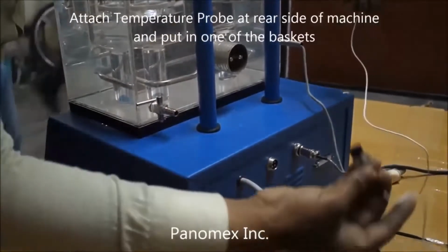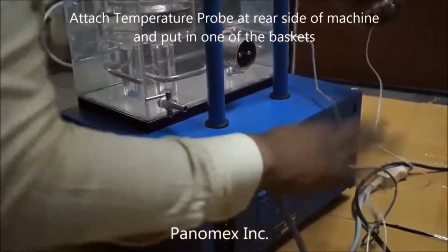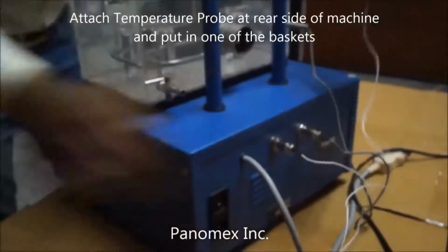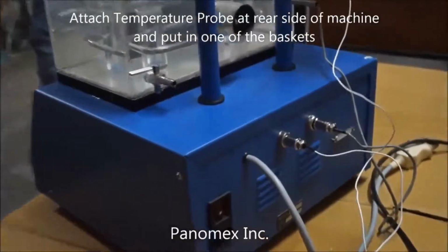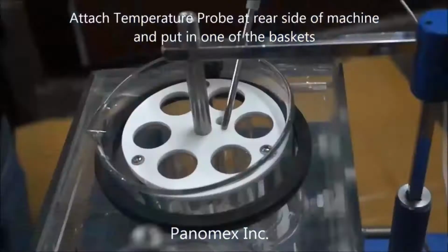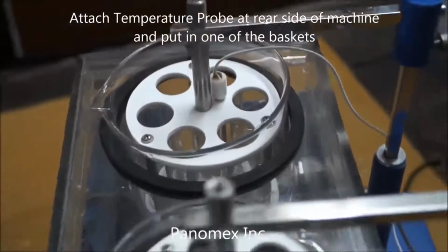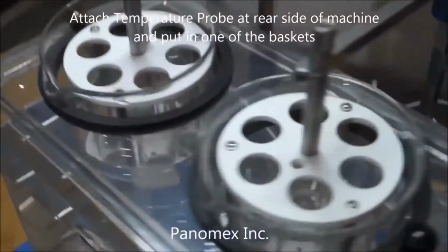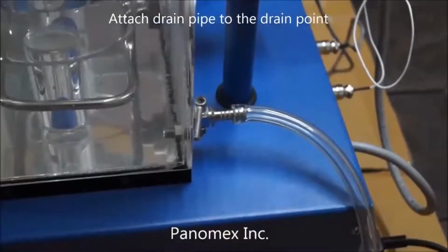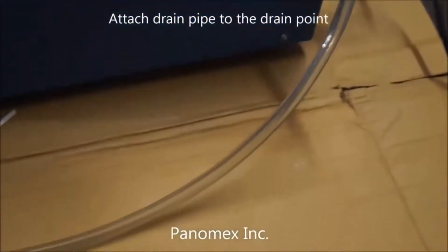Then we have to attach the temperature probe to fix the temperature. Then we have to check the temperature probe. This is the drain pipe, so that after completing the test, we need to drain the water. The whole water we need to drain out.